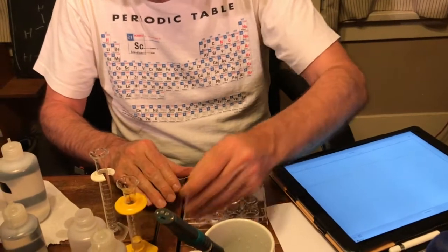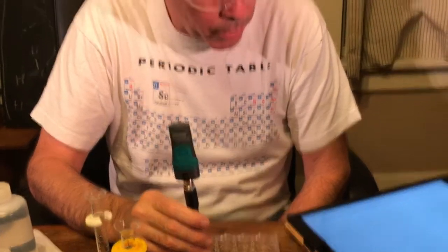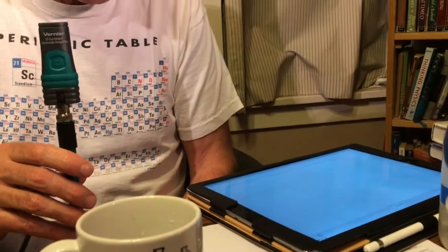All right, now let's measure the pH. Again, what would your prediction be? Would the pH go up? So now we've added 3 mils of the sodium acetate. So does that shift the equilibrium to the left or to the right? And we get a pH of 5.06.